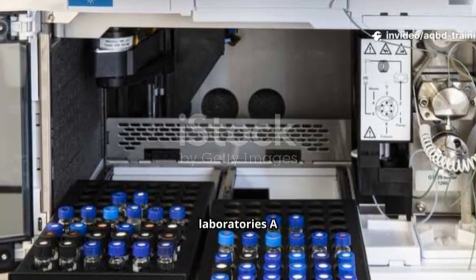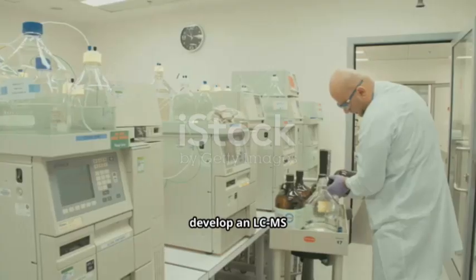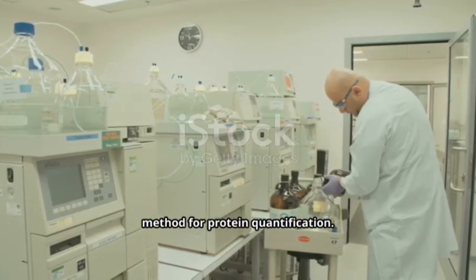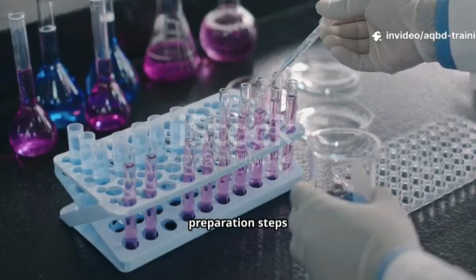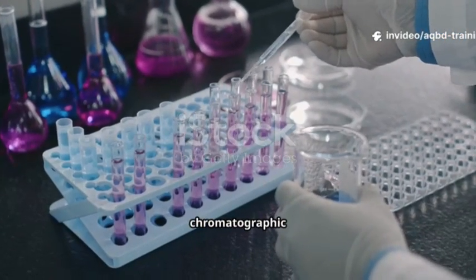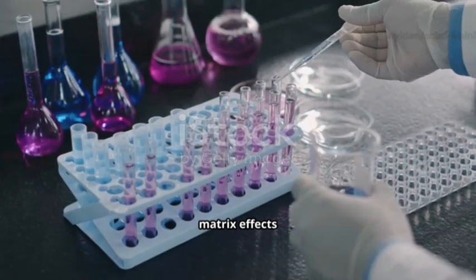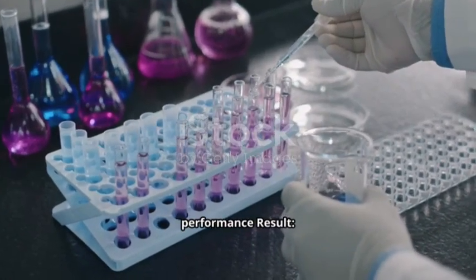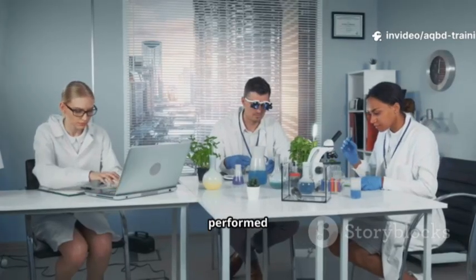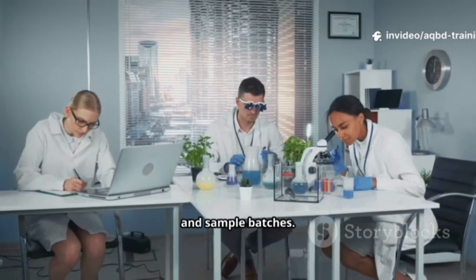across multiple laboratories. A biotechnology company used AQbD to develop an LC MS method for protein quantification. The systematic approach helped them identify critical sample preparation steps, optimize chromatographic conditions efficiently, understand method sensitivity to matrix effects, and develop a control strategy ensuring consistent performance. Result: a method that performed consistently across different operators, instruments, and sample batches.